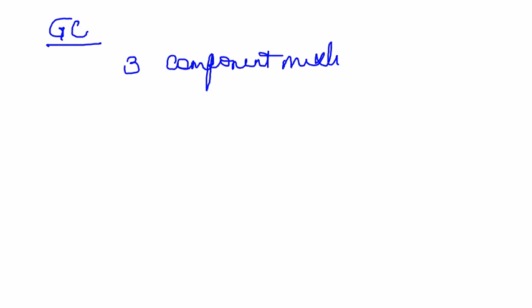So that's IR. As far as the GC goes, let's talk about that. In the case of GC, you'll be given a three-component mixture, and you're going to inject that in the GC. This particular one, the lab tech actually does it for you, so you just interpret it. Actually, throughout the semester, that's what we are going to do. A GC is an analytical technique. It's not really spectroscopy, but rather an analytical technique that gives me information whether I'm dealing with a pure sample or a mixture.